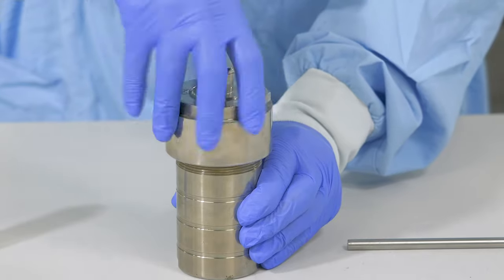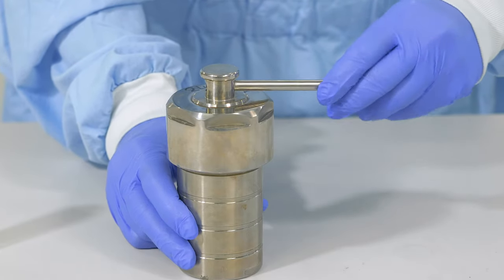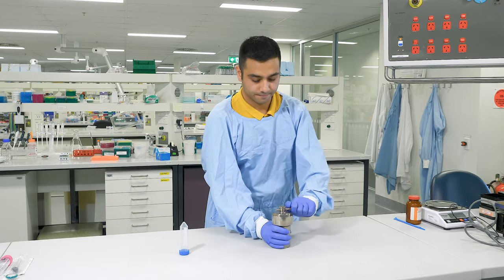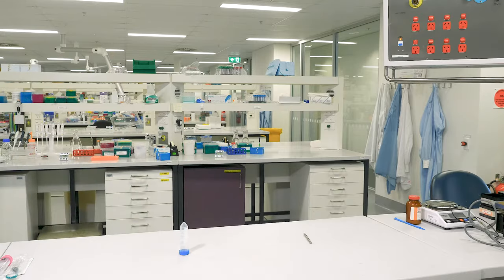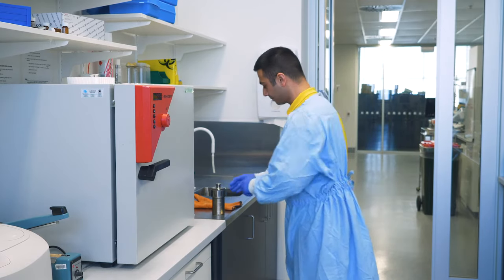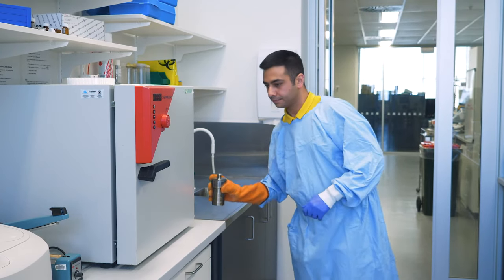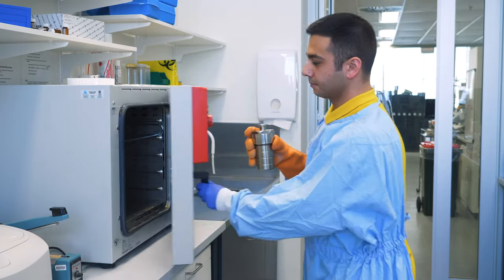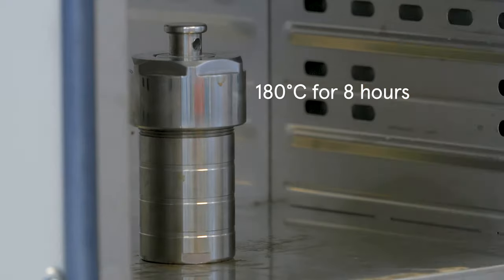I need to close the lid tightly with the locking rod before it goes into the furnace. Okay, now we are at the furnace. Let's place this in there for 8 hours. I will set the temperature to 180 degrees and set the timer. See you in 8 hours.